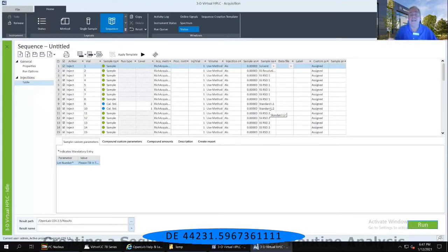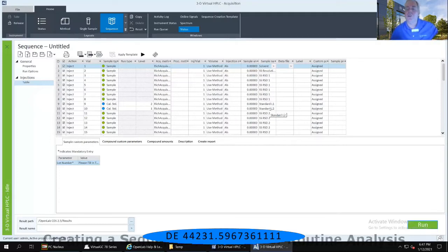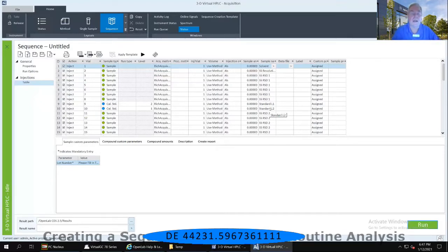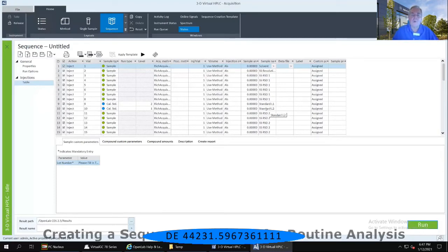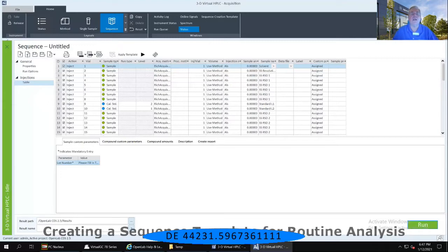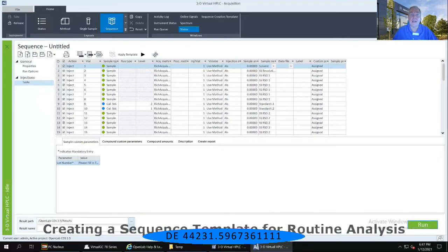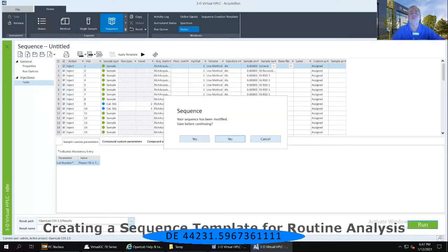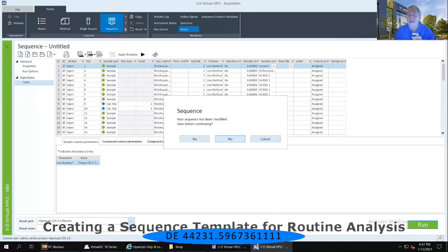That's still perfectly fine, but we also have another tool at your disposal that you can use, especially if you're doing this type of routine analysis where you have to do multiple types of the exact same sequence. Before we run through that, you need to select the icon immediately below where it says sequence dash untitled. Select the very first icon, and that is to create a new sequence from scratch.